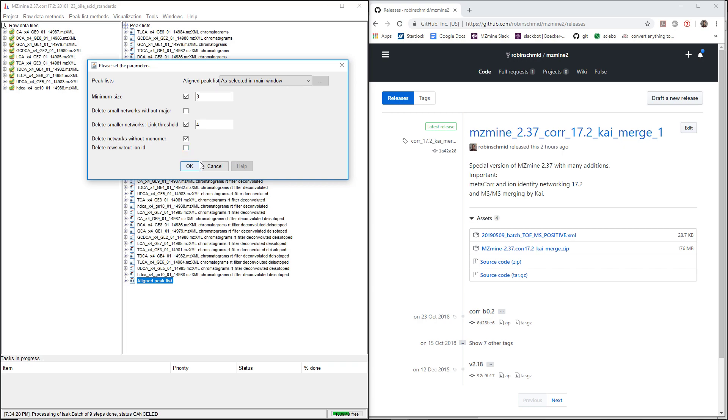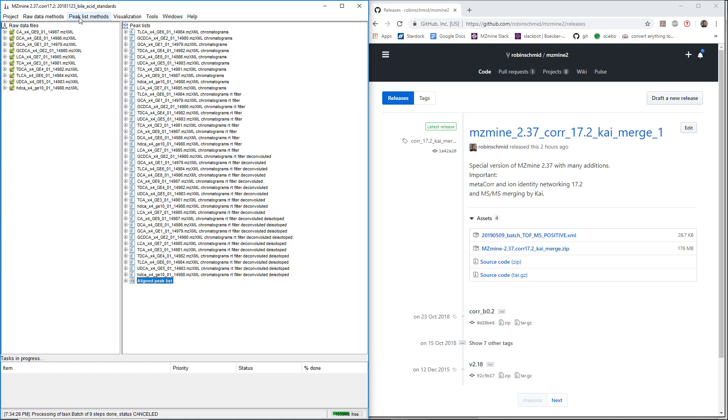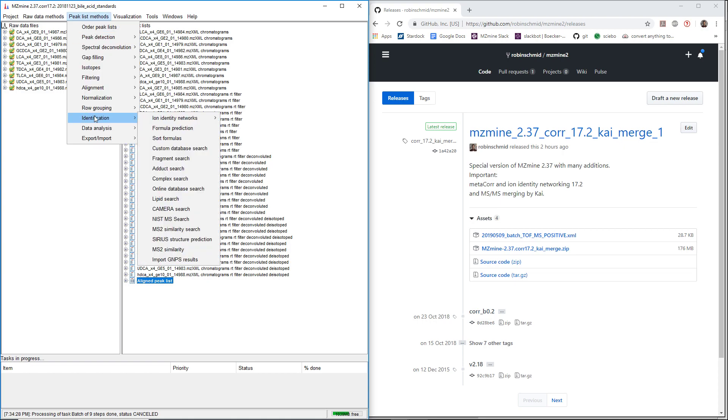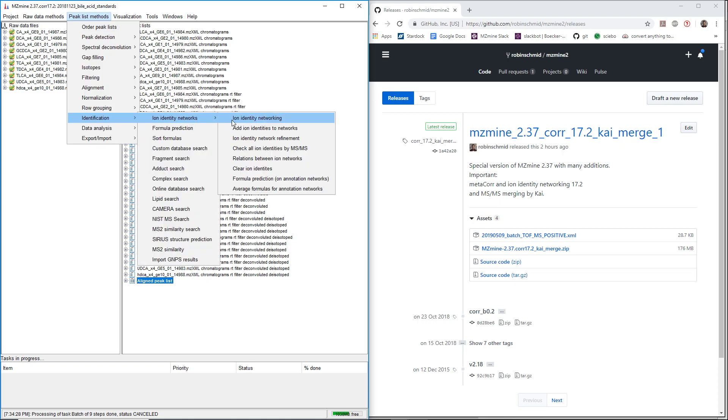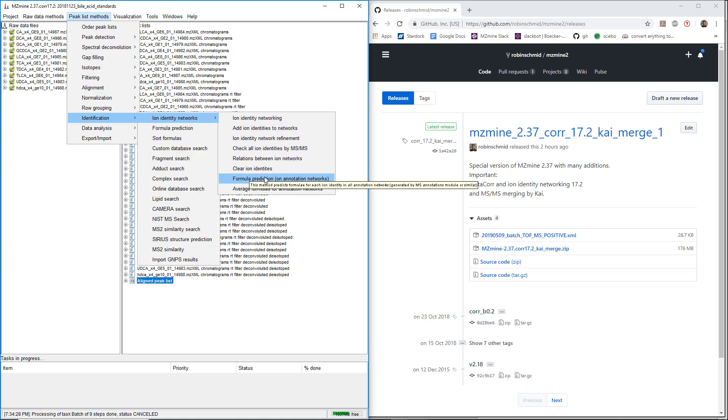The last module that I want to explain here is the check all ion identities by MSMS.